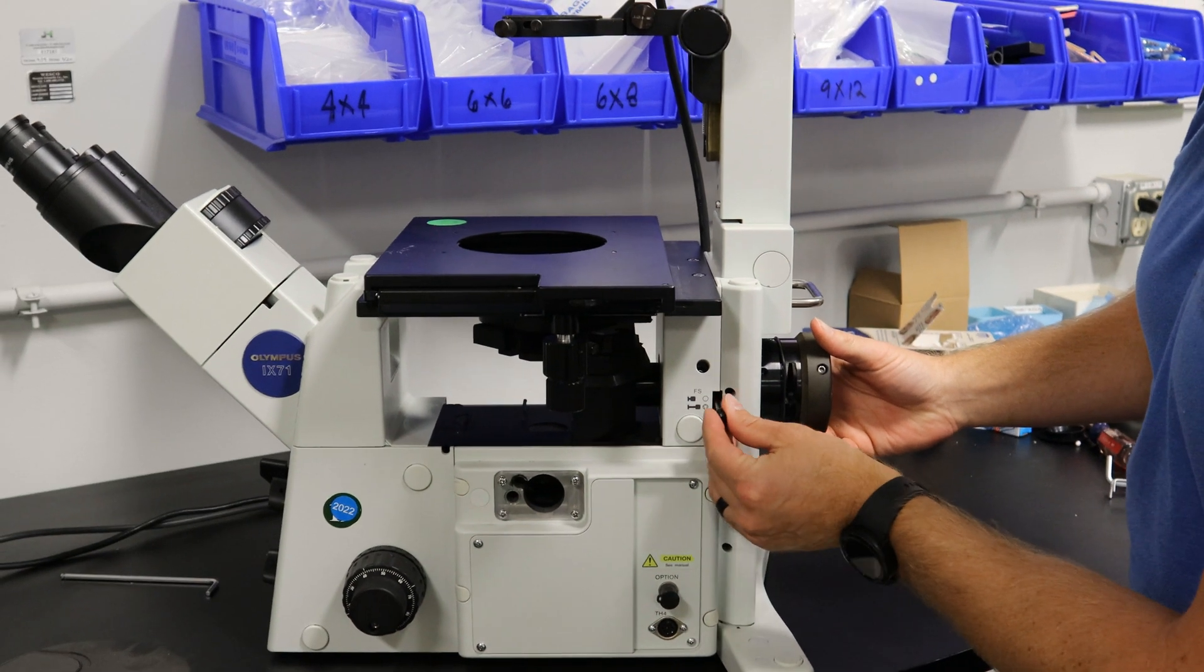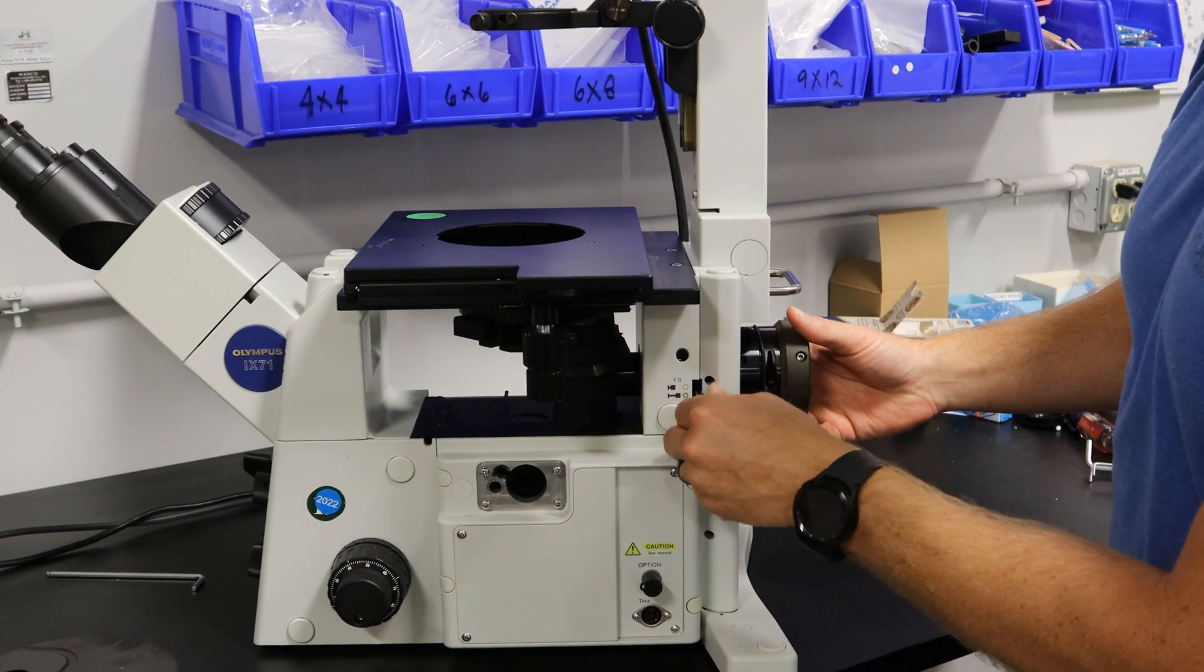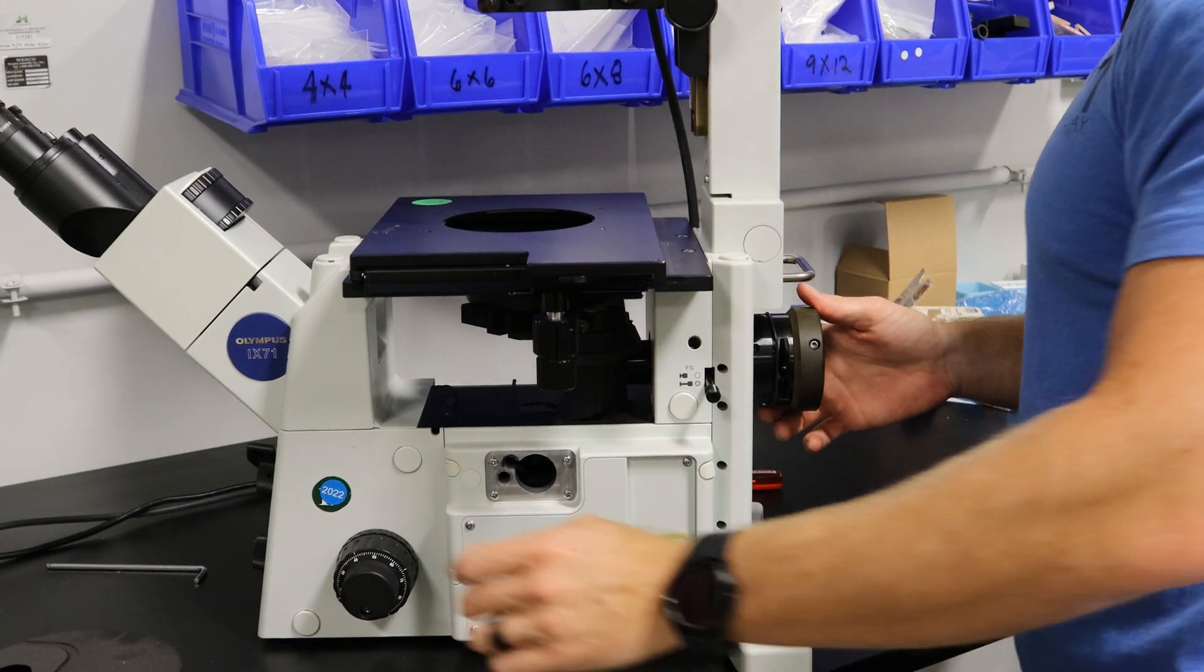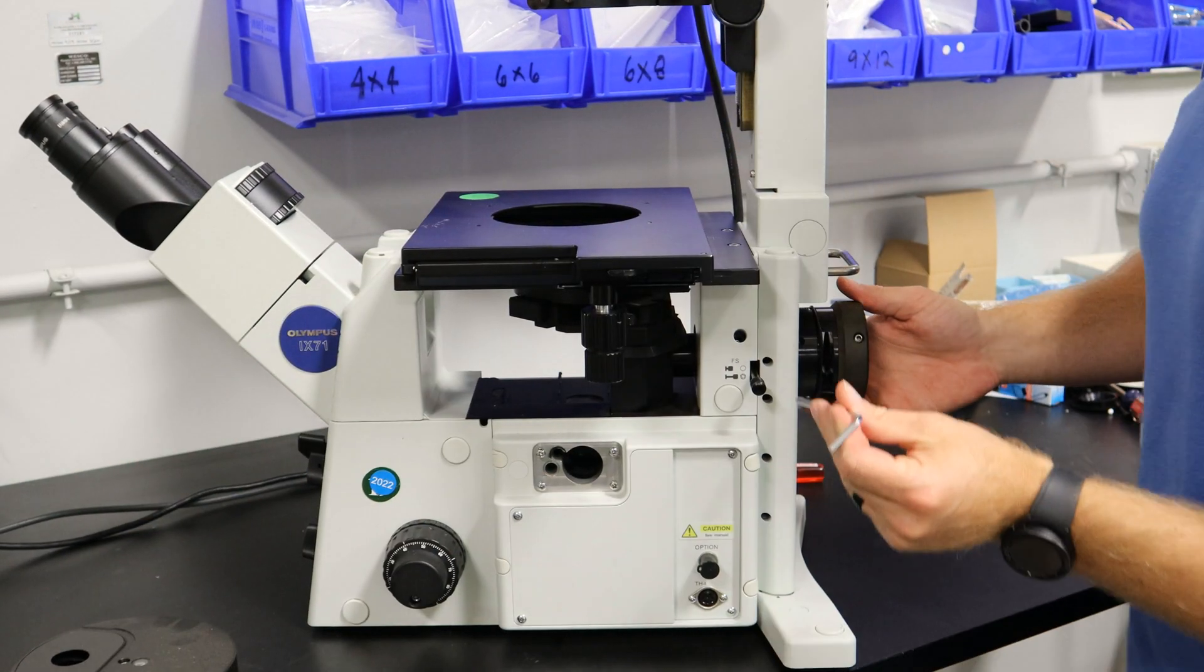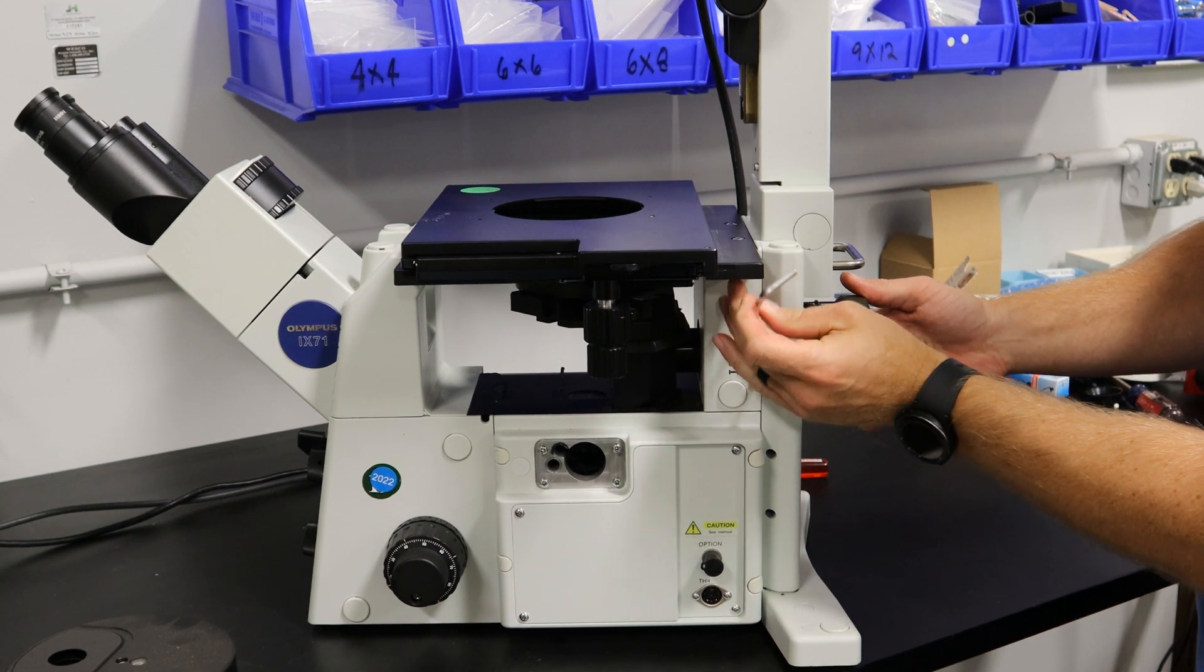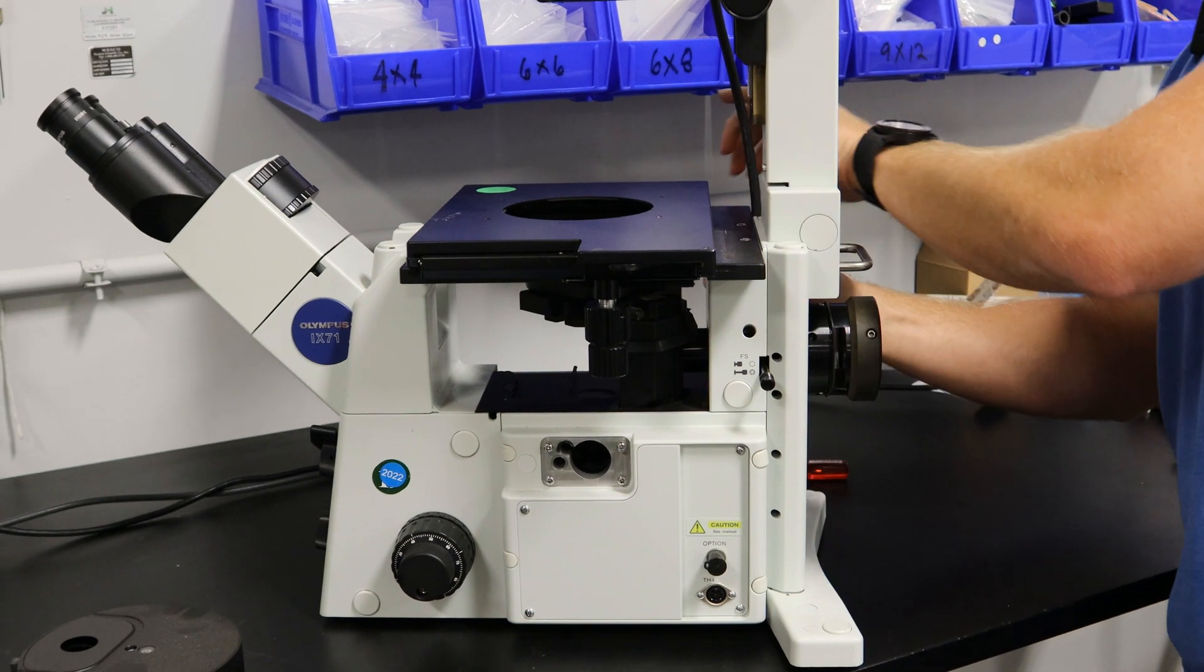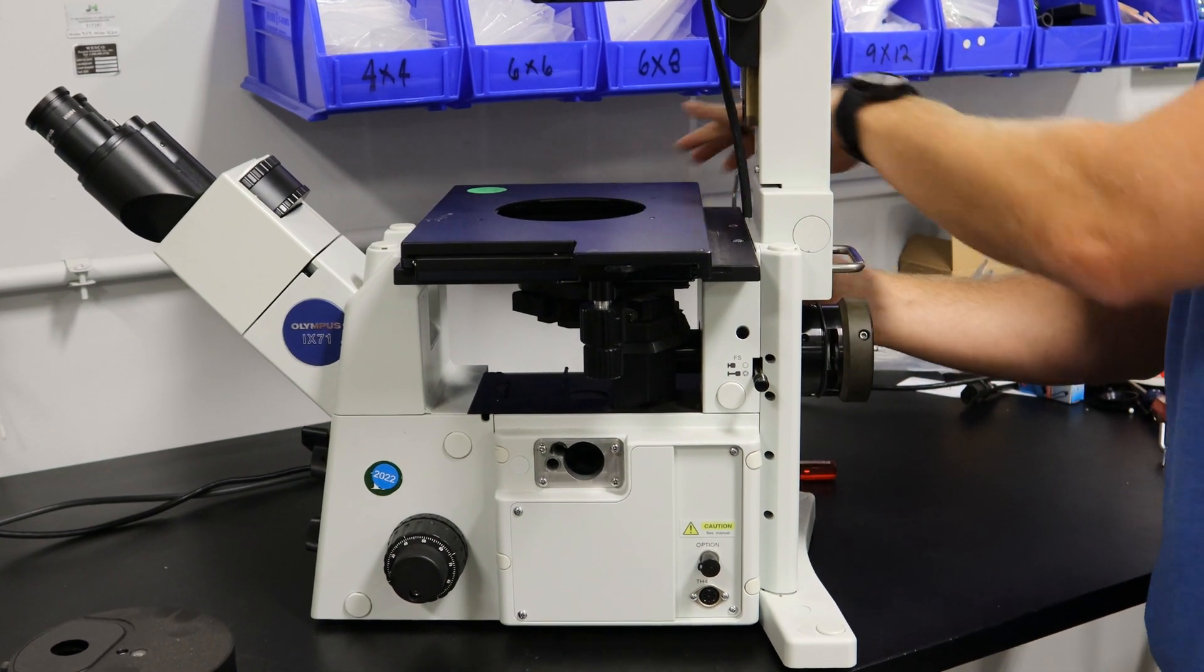Then we're going to put in the field stop here. It screws right in. There'll be four millimeter Allen holes in each side. You'll tighten those down. There's one on the opposite side. You just saw it when we were doing the disassembly.